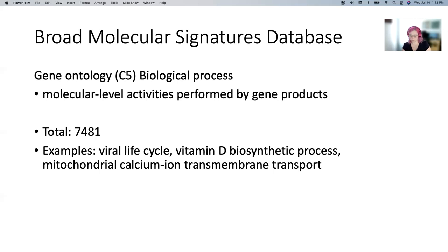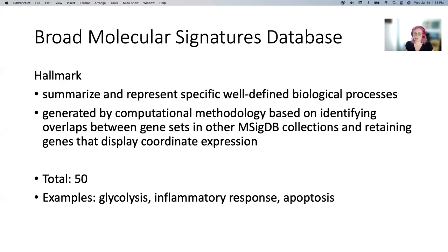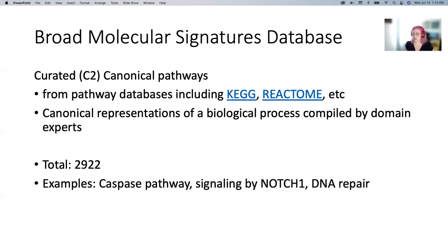It's nice to have C2 and C5 together because they range in how specific they get. Sometimes you get a hundred gene sets and it allows that granularity of seeing that one general gene set is the general version of three other more specific ones. Sometimes that doesn't work though — sometimes it's not interpretable and you really need to go back to Hallmark. One big thing we've noticed is that if you have a lot of significant Hallmark terms, you will have an unreasonable number of significant more specific terms. So we generally start with Hallmark, do some biological interpretation, look up some individual genes highlighted by those terms, and then if we need more granularity we run the other sets.